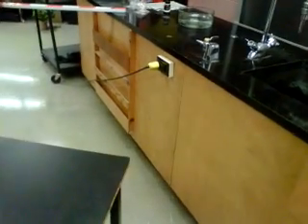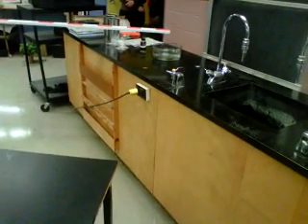Okay, hold on. That's potassium. This time stand back. Potassium. After this reaction, we're gonna show you what cesium does, the first time we're expecting that, on the screen, on YouTube. I'll put it on right now, and then you can put it on the screen. Let's just see what this one does now. Is it over it? I can't even see from here. Yeah, it's over it.